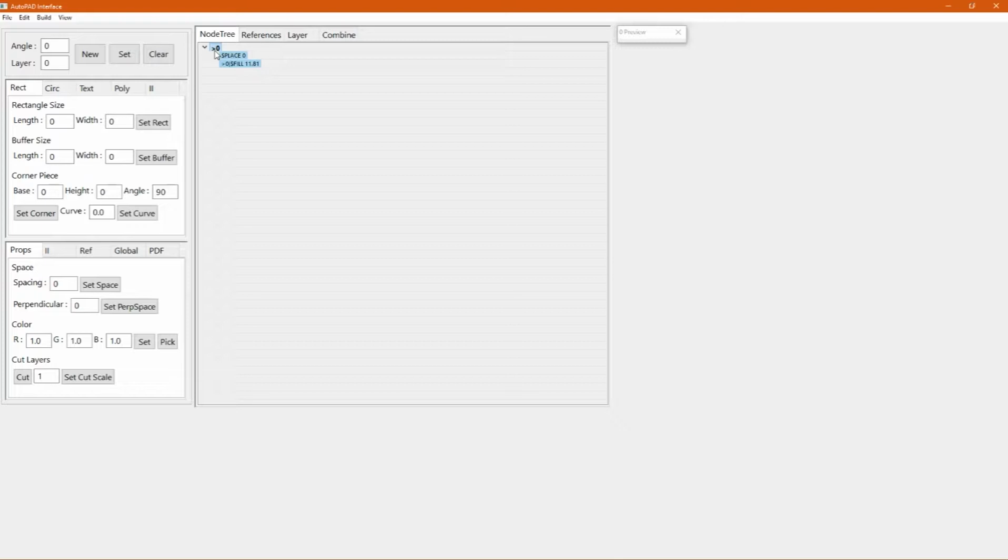We're going to shoot for 3 layers, and we want to make it so that we can deposit liquid in a circle on the top and have it flow down to the middle where it splits off in 2 directions, and then finally goes down to the bottom layer where it can be seen. And this will make more sense as we get into it. So we can start right now by selecting our 0 origin and making a new object. And we can see how this pops up in our editor here, in this bold print object node here.